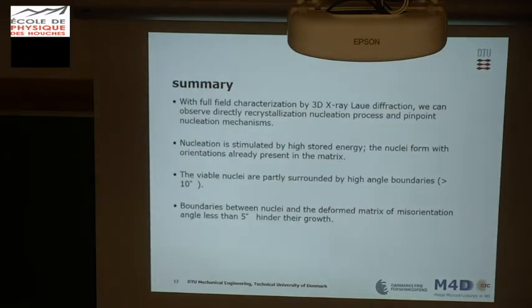Here is a short summary. With this technique we can now really observe in situ the nucleation process and pinpoint some nucleation mechanisms. The nucleation is stimulated at the high stored energy regions and has orientation already present in the matrix. And the boundaries with misorientation higher than 10 degrees are good for the nucleation, and less than 5 degrees probably hinder the growth.